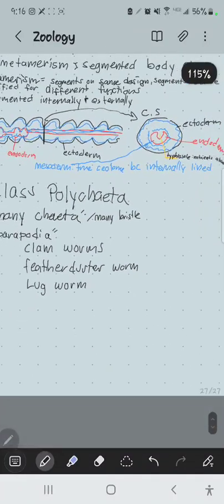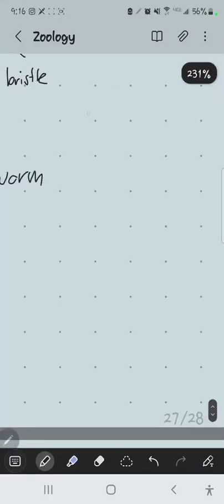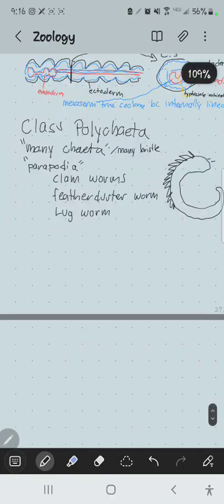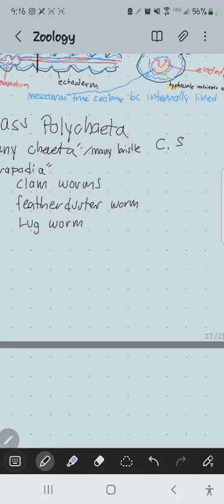So what a polychaete looks like in cross section is something like this. It looks like ears or flaps on every segment. So these are the parapodia, and the bristles are stout bristles that occur on the upper and lower lobes of the parapodia.